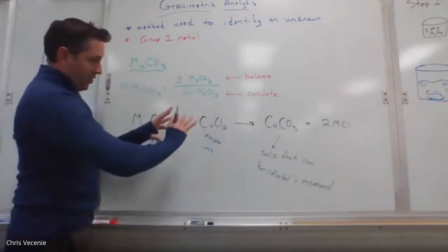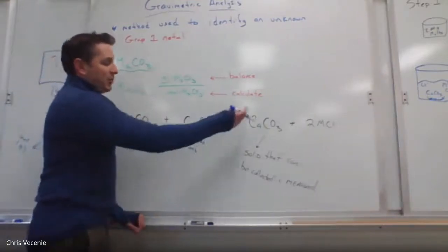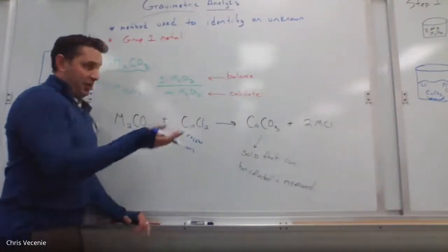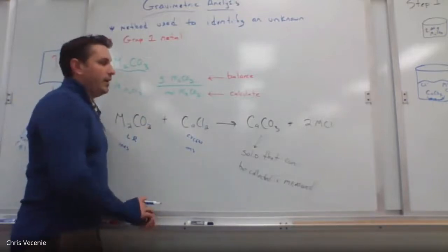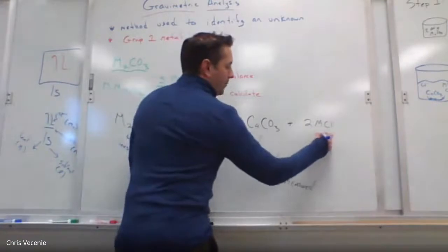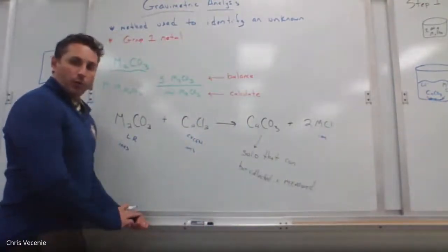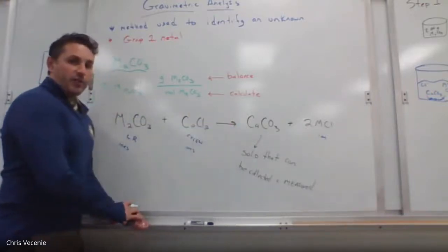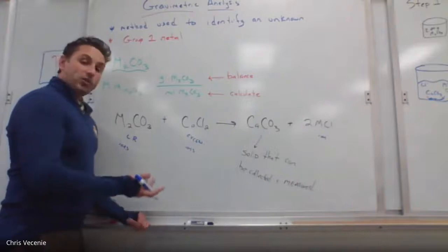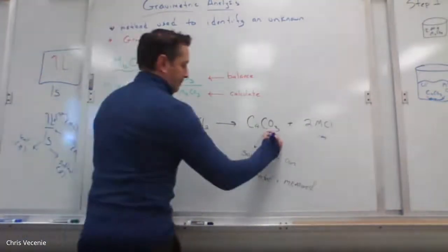When I mix those, I'm going to double replace, and I'm going to create calcium carbonate and some metal chloride that I don't know, but I do know the metal is from group 1. So I know my metal chloride is going to stay in ion form because group 1s are always soluble with no exceptions. The calcium carbonate, calcium doesn't have an individual rule. Carbonates are generally insoluble. That means this guy's going to be a precipitate.